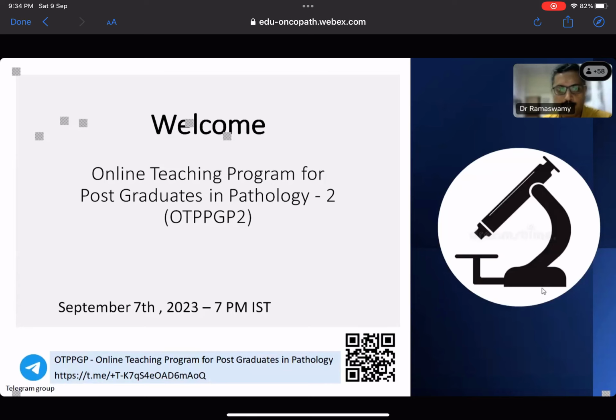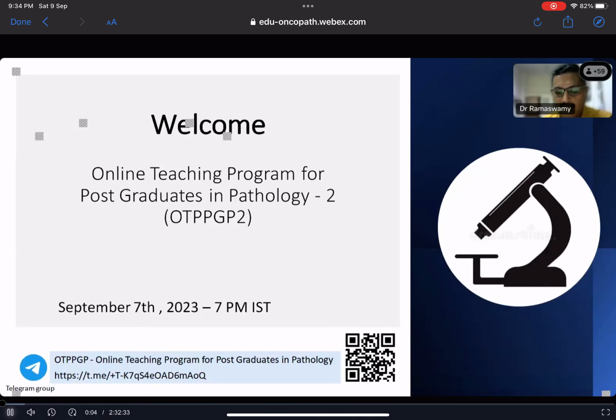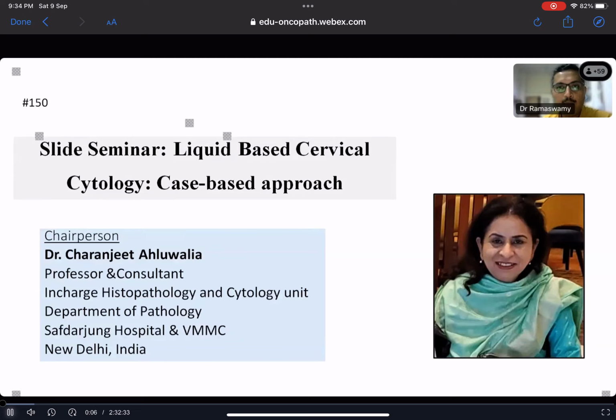Graduates in pathology. Today we are having a slide seminar and the topic is liquid-based cervical cytology, a case-based approach.